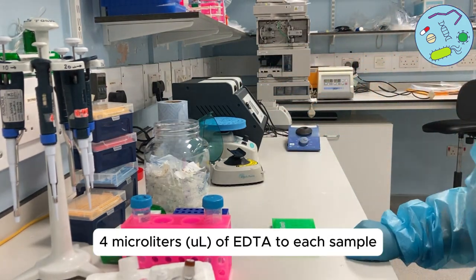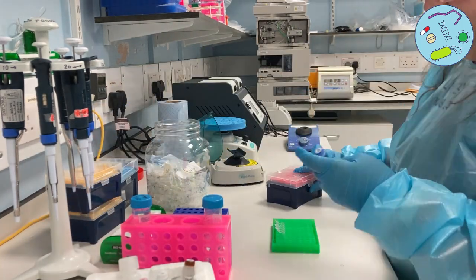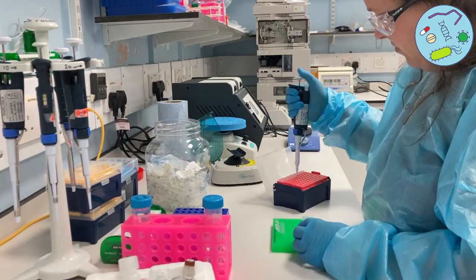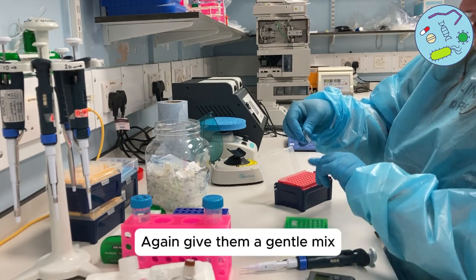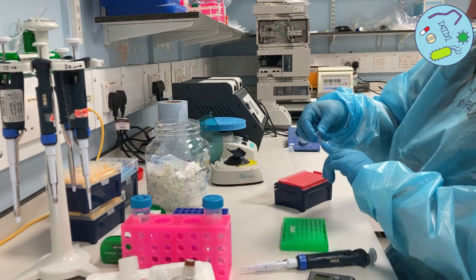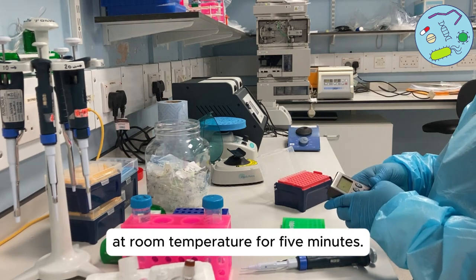The next step is to add 4 microliters of EDTA to each sample to stop the reaction. Give them a gentle mix to make sure the EDTA is spread through the sample.